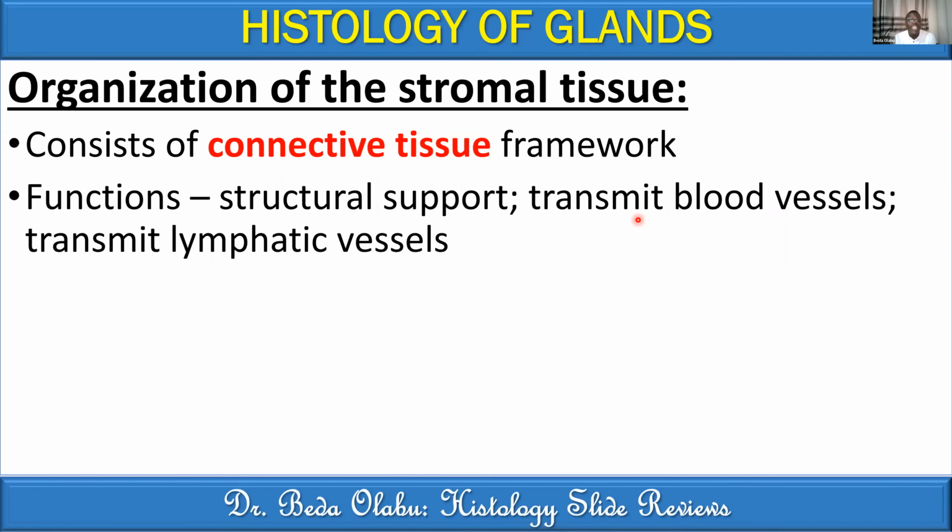There'll be most likely arterioles and capillaries, but you can still have smaller arteries there as well. This supporting framework contains blood vessels within, and is a way in which the blood vessels can be on the surface and also others going through into the organ via the connective tissue elements.